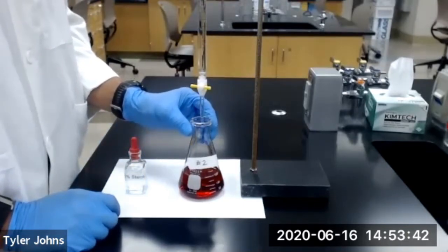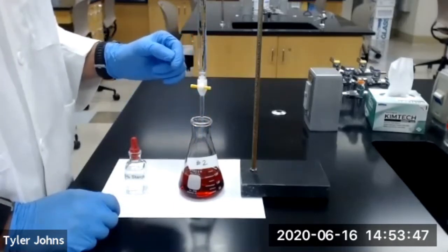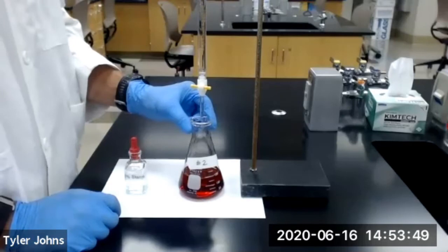So we're going to first slowly add 2 milliliters of our sodium thiosulfate solution from the burette into the flask with swirling.